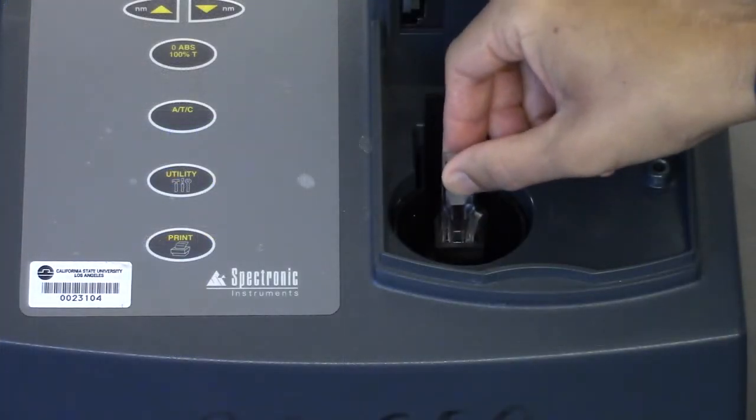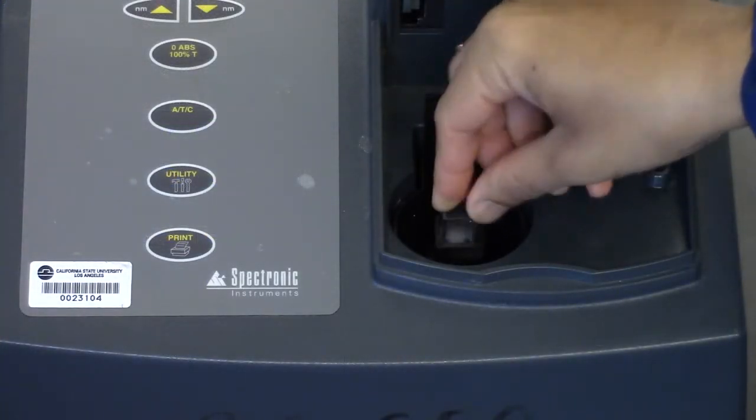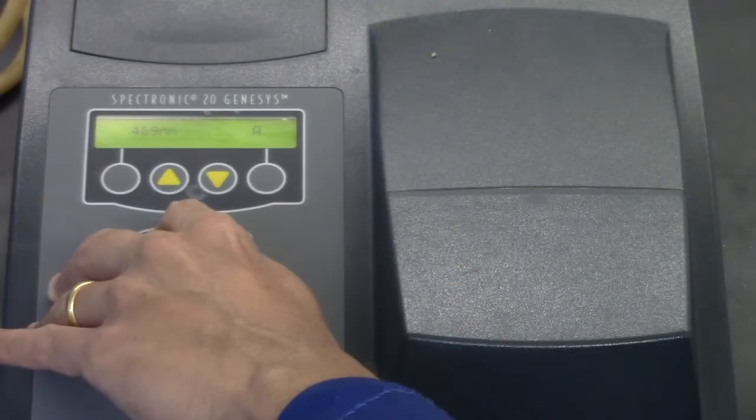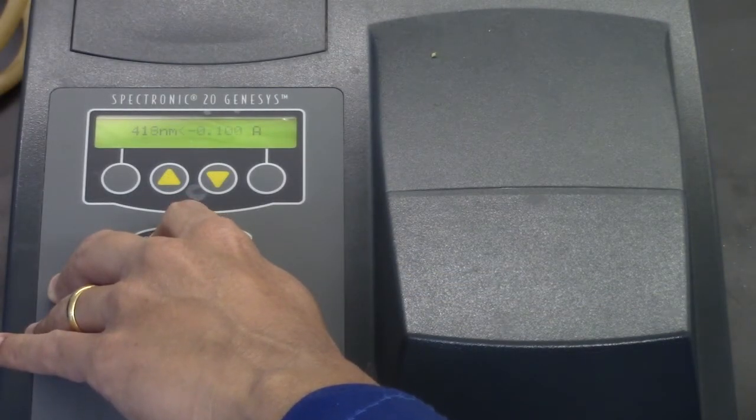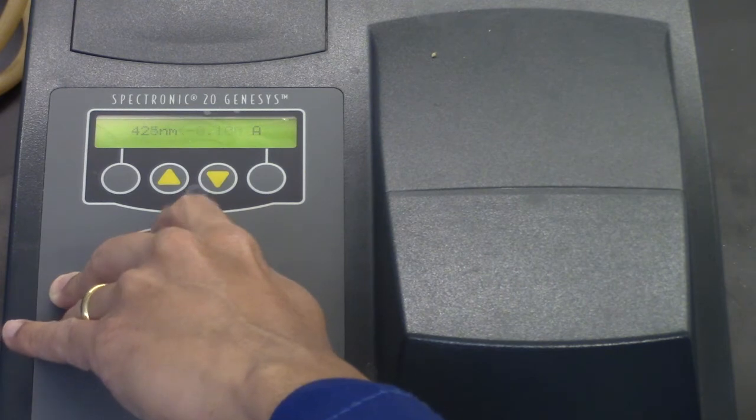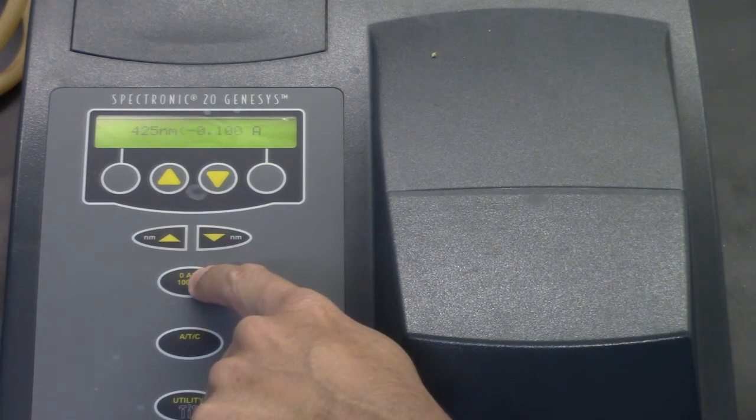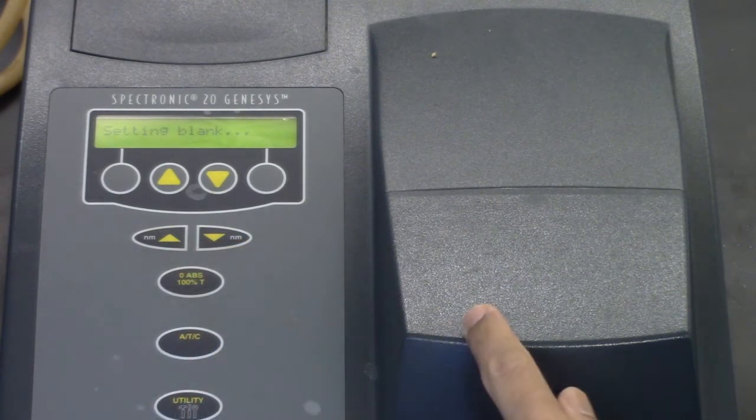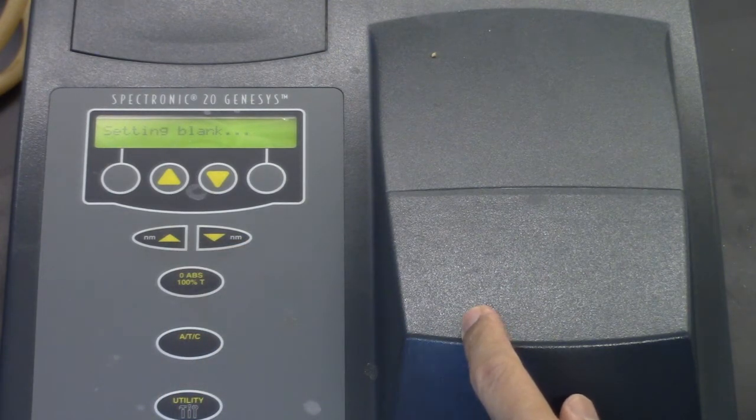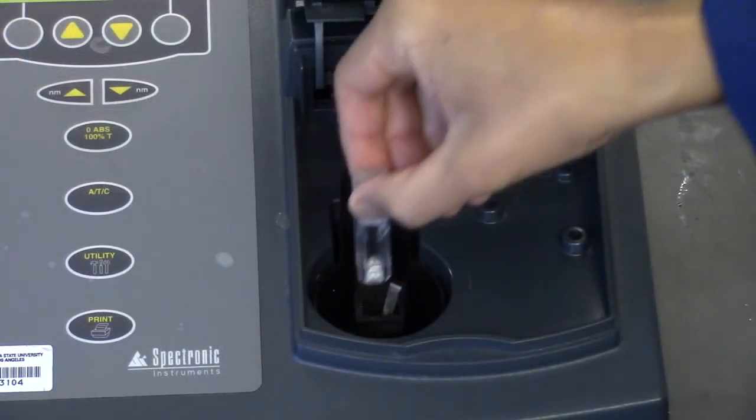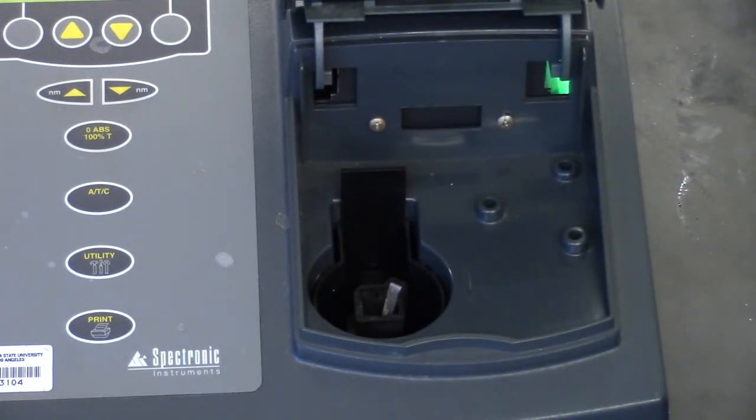Change to the next wavelength and calibrate again with the blank. Remember to always use the blank and set the absorbance to zero for each wavelength. Insert A3 and measure the absorbance.